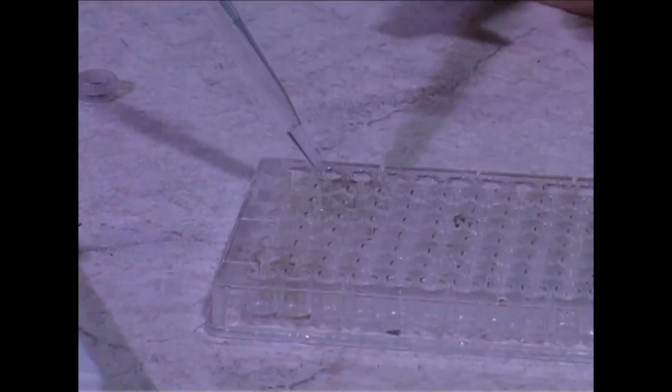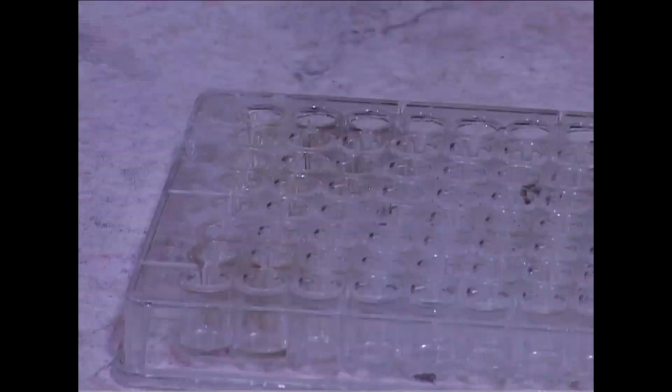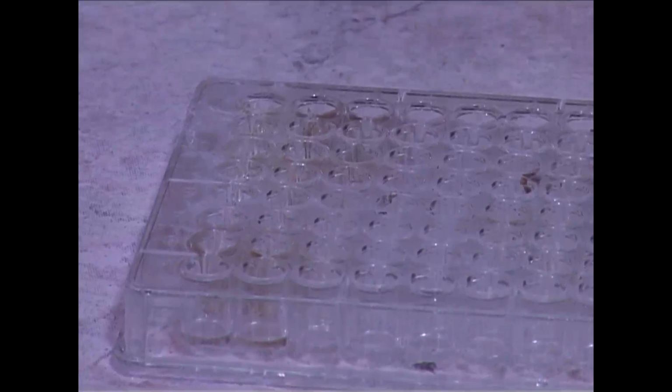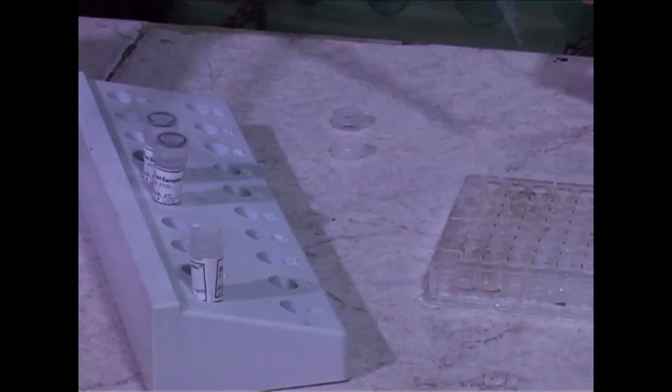Direct ELISA is the simplest of all ELISA techniques. How can we perform direct ELISA? First we have to add the antigen sample, both standard and test sample, in microtiter wells, and give some time for adsorption of the sample to the microtiter well. Microtiter wells are made of polystyrene or polycarbonate material, and the antigen which we want to analyze is normally a protein which will bind to the polystyrene or polycarbonate material through non-covalent interactions, mainly through hydrophobic interactions.